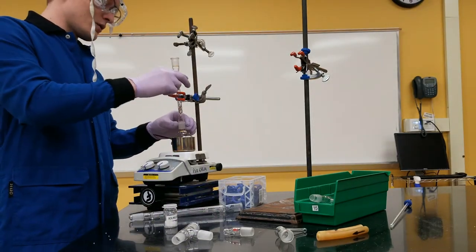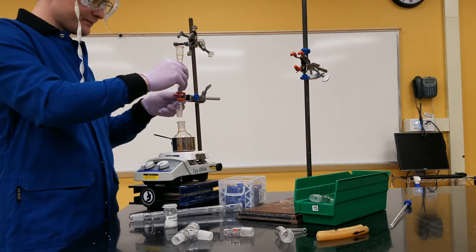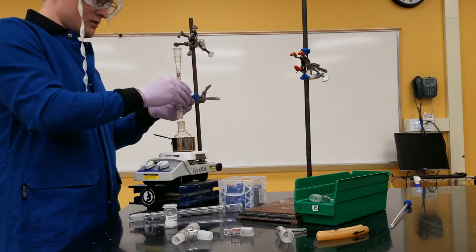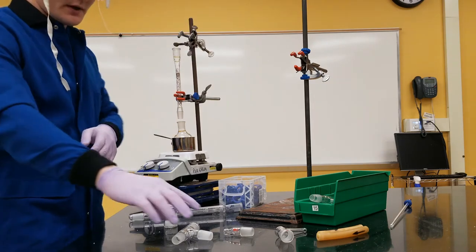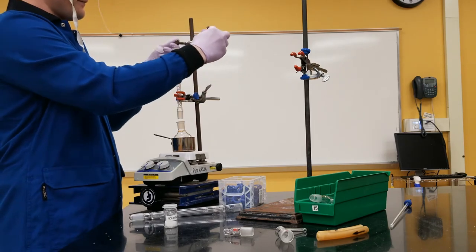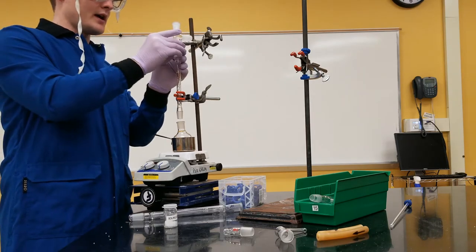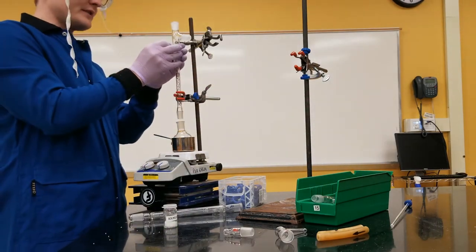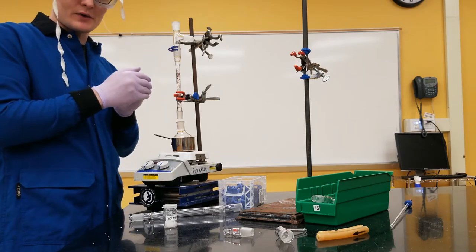So that's going to go right on top of our round bottom flask. I'm going to go a little high here. Working with these clamps is always awkward and takes forever, and this is a huge glass setup, so definitely a tricky little manual manipulation struggle. So the next thing that we're going to attach is a three-way adapter, and it's got a lot of different ends here with different purposes. I'm using these little plastic clamps just to clamp my glassware together and keep it stable.